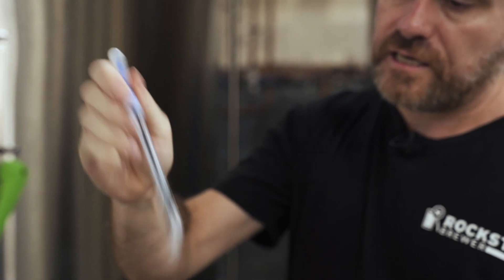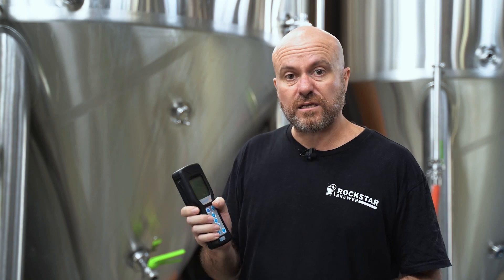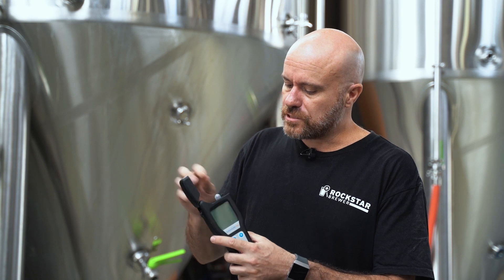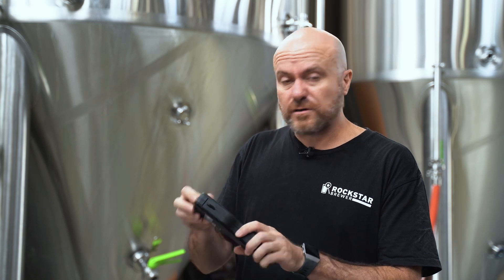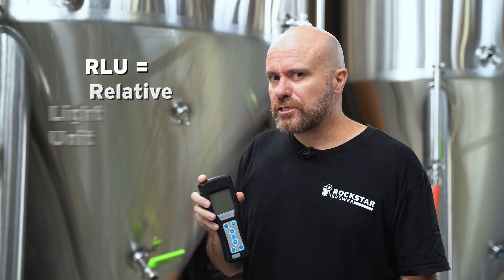The really cool thing about this enzyme is it actually comes from fireflies. What happens with the luciferase enzyme is when it comes in contact with ATP, it breaks off a couple of the phosphate molecules and actually glows. The ATP meter basically measures that glowing, and that's how it can tell you if there's ATP inside your tank. It measures the light generated by the luciferase enzyme — inside the ATP meter it's very very dark, so the machine is able to measure that glow.